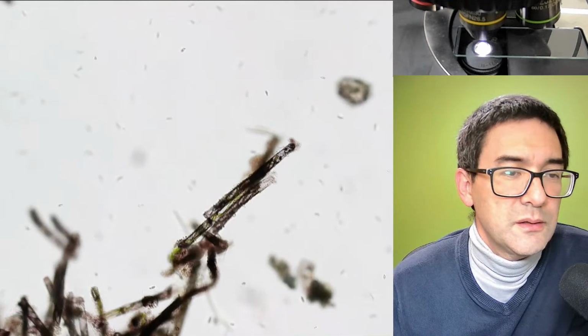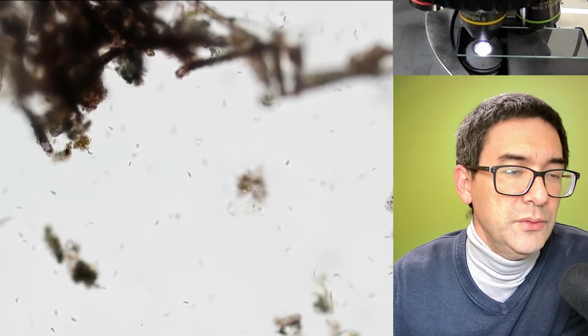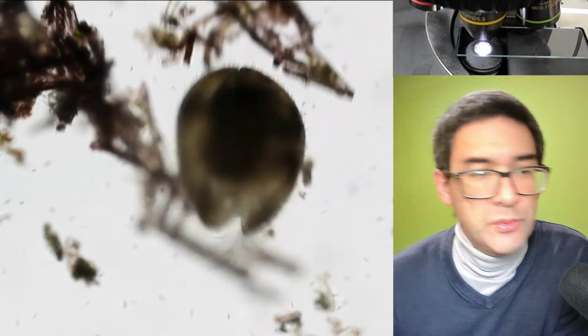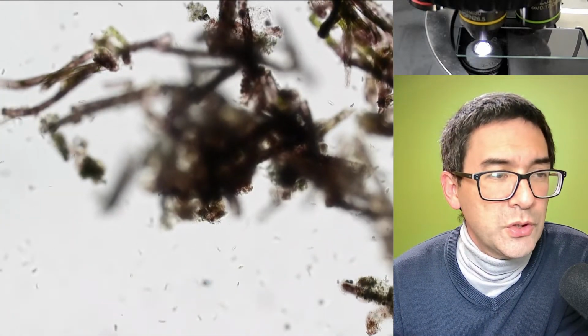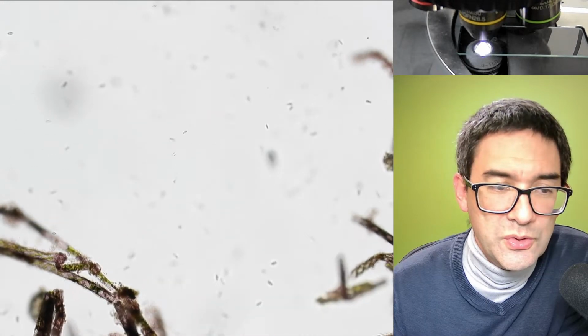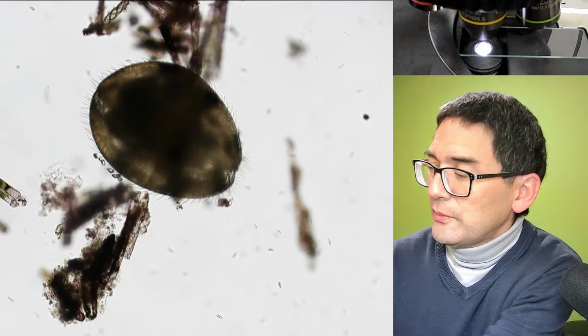Is there anything else? Yeah, lots of smaller microorganisms in the background. So what I could try maybe is the following, because we already checked out the ostracod. I think I'm going to remove it again, and I'm going to add a cover glass here and some of the spice to see how those single-celled microorganisms actually behave. So I'm going to remove this again, and I'm going to take off the ostracod again, if I'm able to see it.